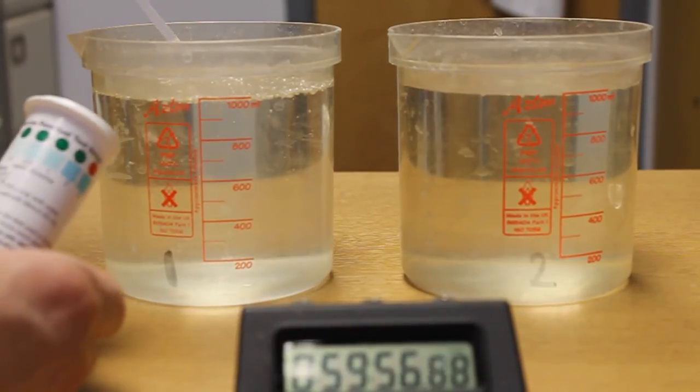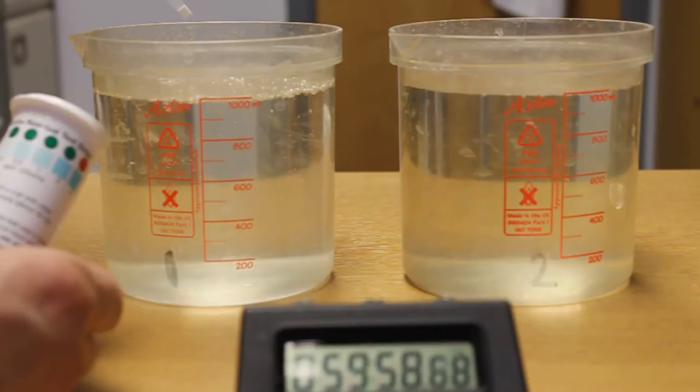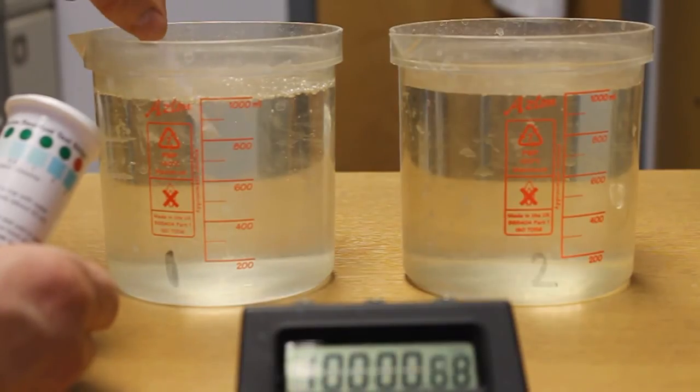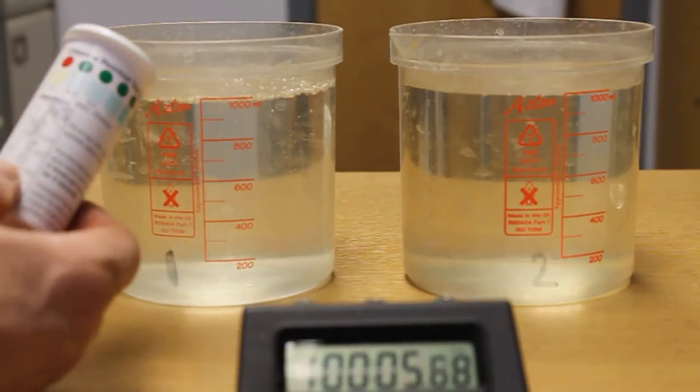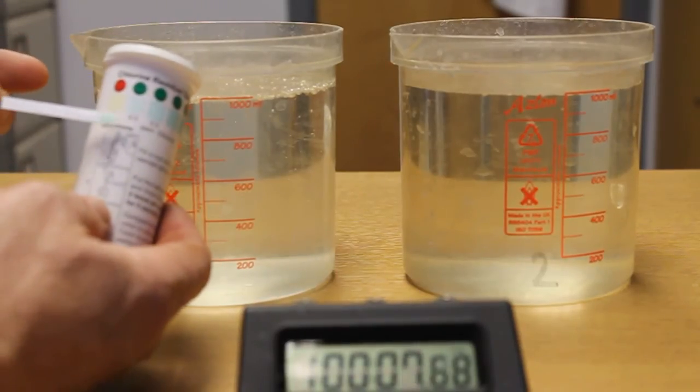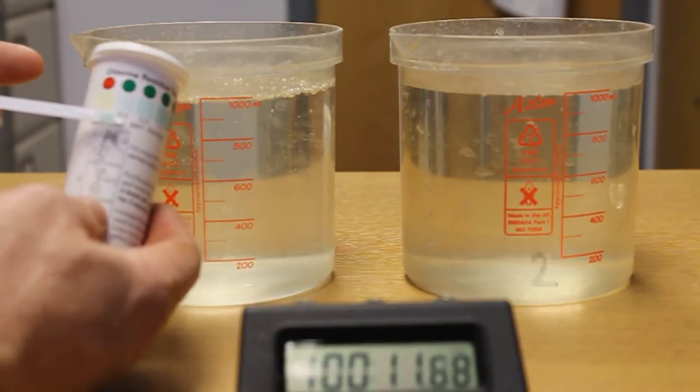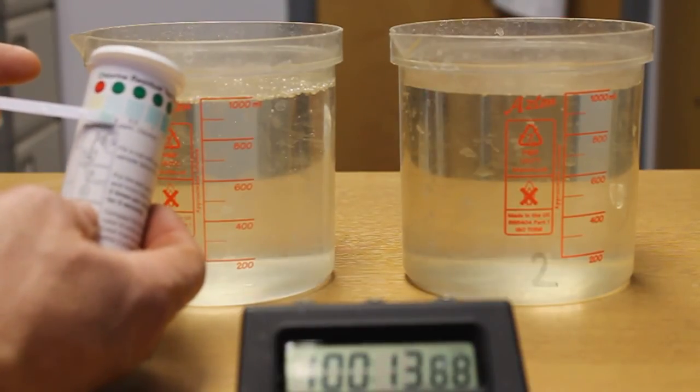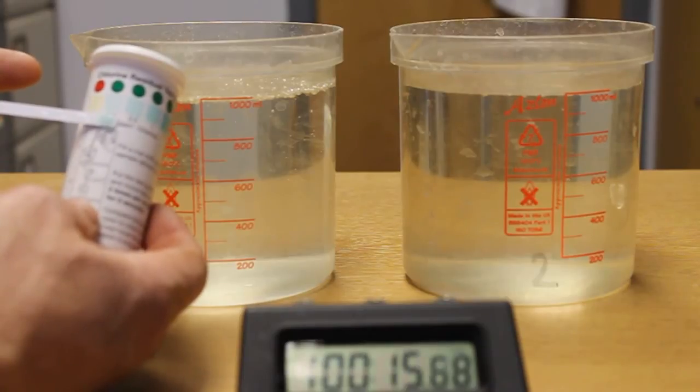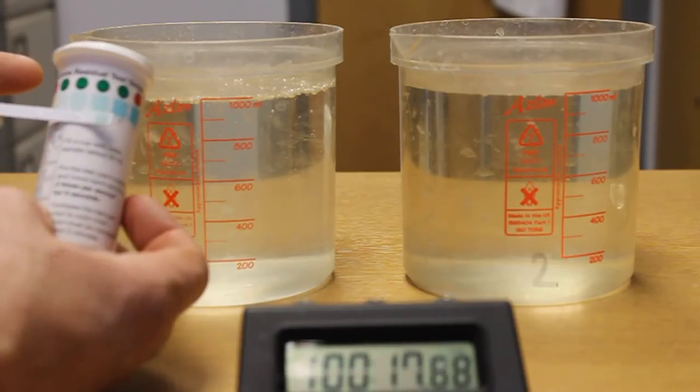Put in the strip for 5 seconds. 1 second, 2 second, 3 second, 4 second, 5 second. And now compare the colour on the guide. We can see the colour on the guide is coming in at about 0.3 chlorine on this strip.